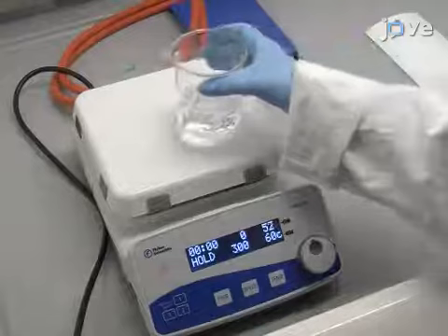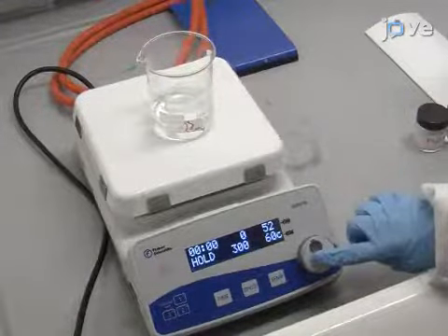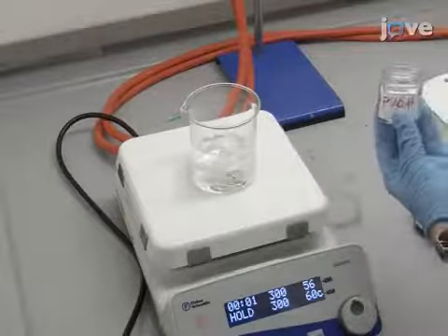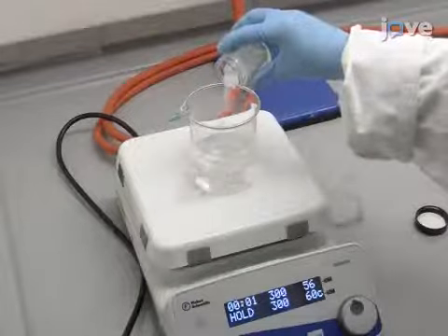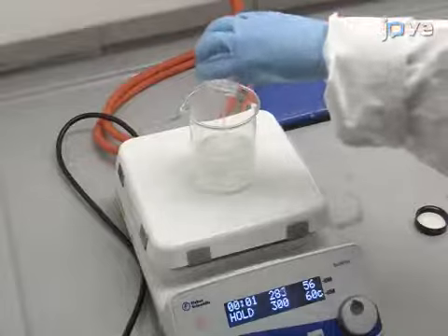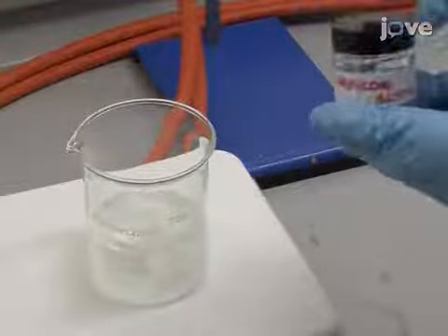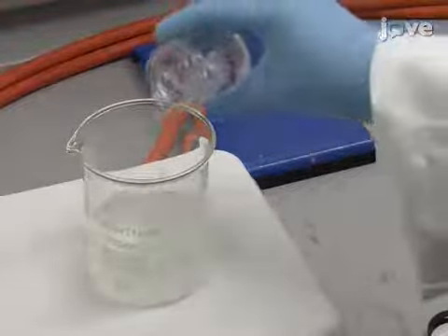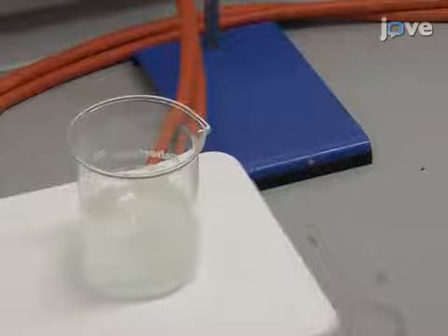To begin this procedure, heat a beaker of purified water to 60 degrees Celsius. Add polyvinyl alcohol such that the final weight percentage of polyvinyl alcohol in solution is 8%. Then add monopropylene glycol such that its final weight percentage in solution is 10%. Stir the solution for 6 to 8 hours to ensure homogeneity.